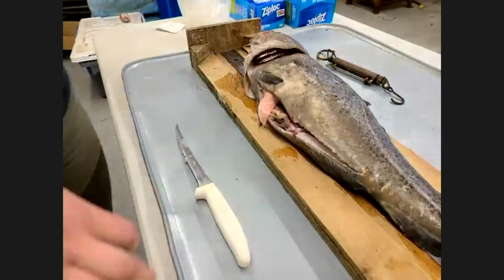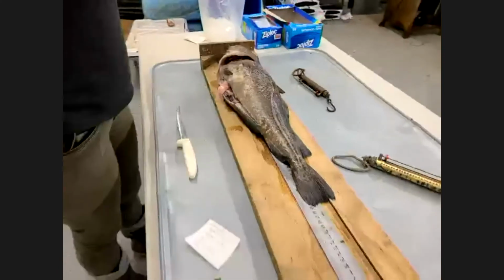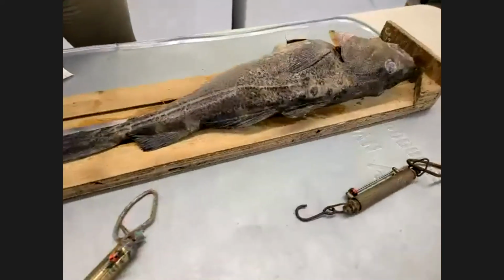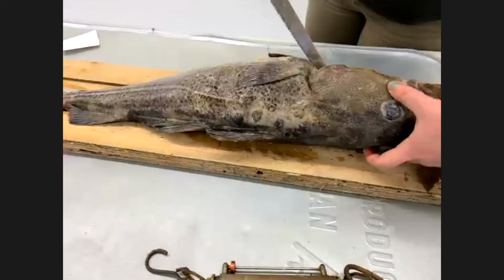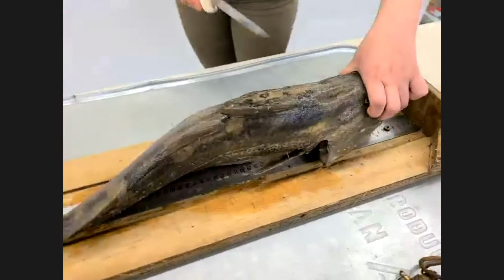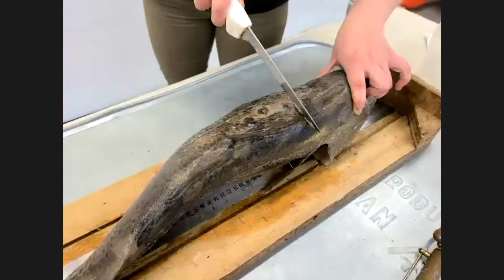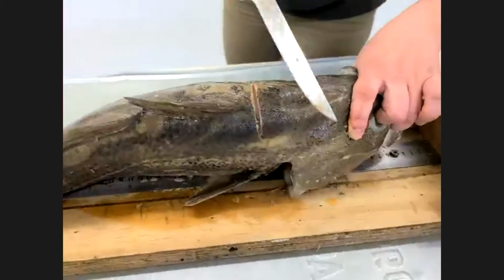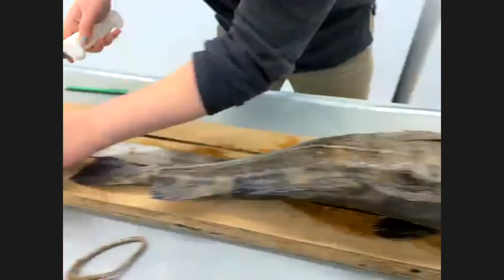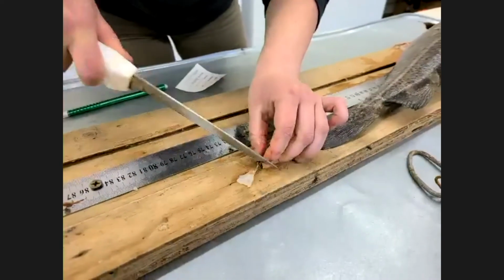So we have that. The next thing that we're going to do, I would normally be taking a picture, but we've got lots of pictures happening at the moment. And I'm actually going to switch knives, I think. And it's a little frozen, so we'll see how the cutting into its body goes. But to take a sample, the stable isotope samples for Simon, here's the dorsal fin here. Just gonna cut a little bit ahead of that into the fleshy part. This is definitely a bit too big of a piece, so I'm gonna cut this down a little bit, like that.